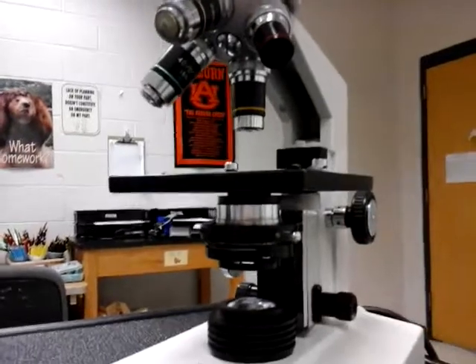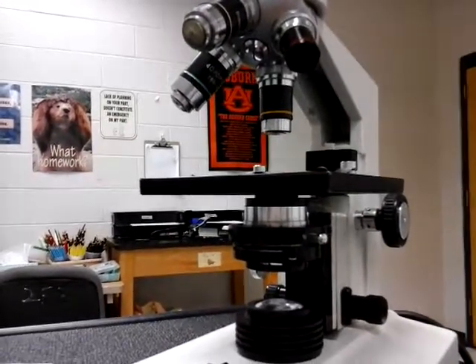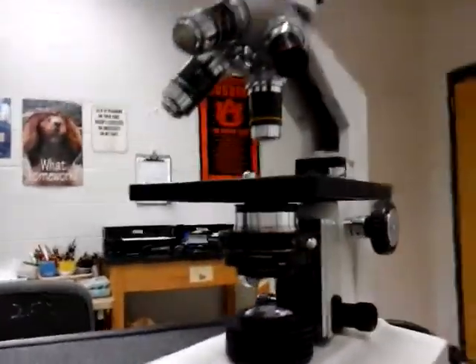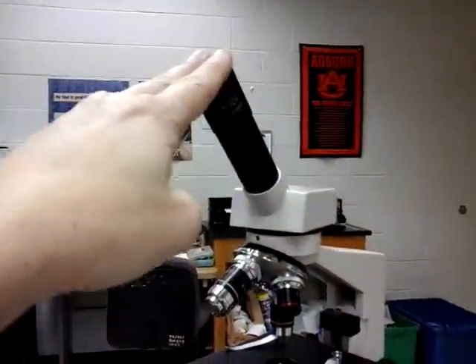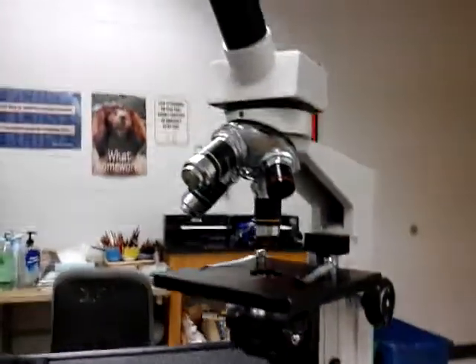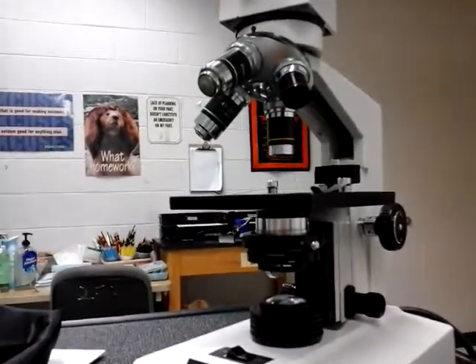And that objective on your page, yellow, magnifies things 10 times. When you look at it, you can see that there's a stamp on there. Like there's a 4. Well, the yellow one is stamped 10. So when you're on medium power, you're magnifying things 100 times because you're magnifying things 10 times here times the 10 that you're magnifying it here. So medium power is yellow, and that magnifies things 100 times.